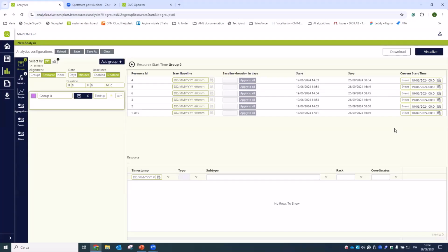You don't have to realign a cage starting at 10 with a cage starting at 4. They should both start at 10 or at 4 to be realigned. Otherwise, the group will be created with data belonging to different intervals of the circadian pattern. This is the point where you select the cage-by-cage starting time for this internal realignment within the group.